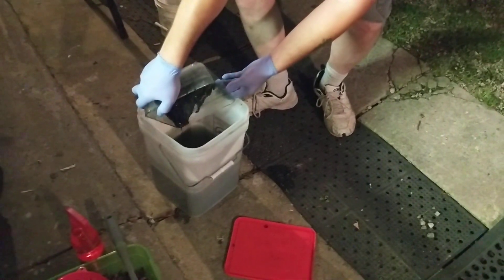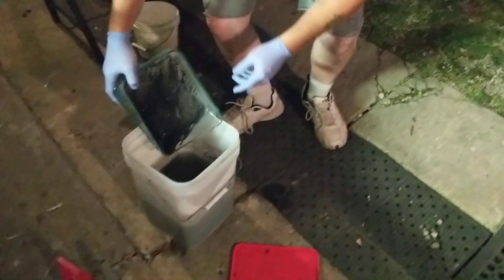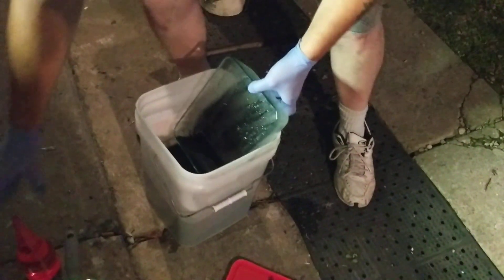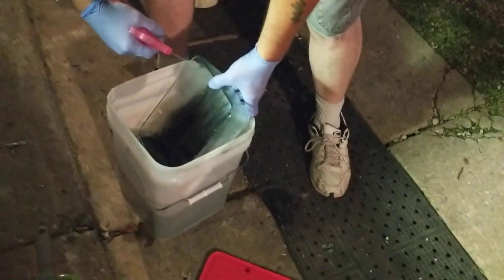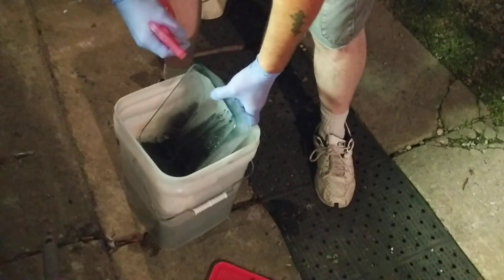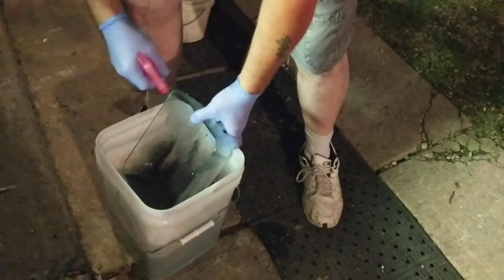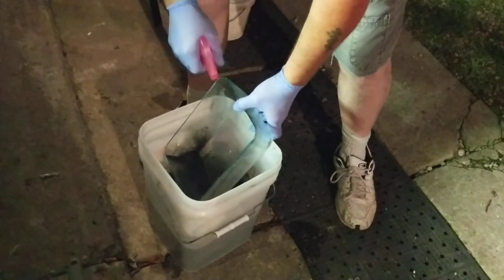I don't know if you were able to pick that up — as I was pouring this in, it splashed out. Guys, this ain't no joke. Don't ever take it lightly, okay?